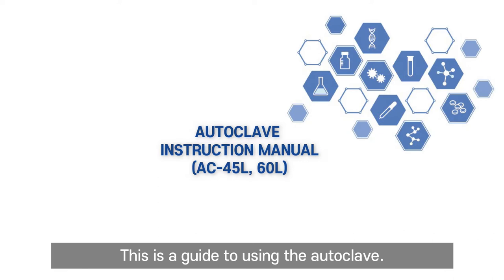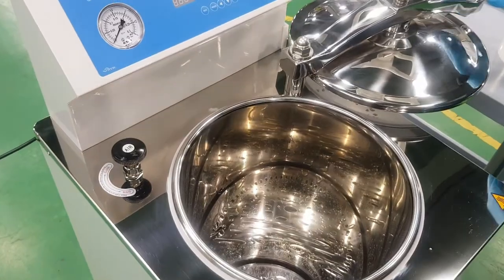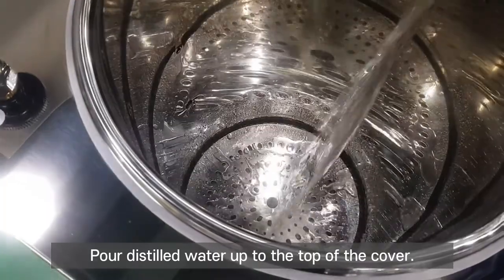This is a guide to using the autoclave. Open the door. Pour distilled water up to the top of the cover.